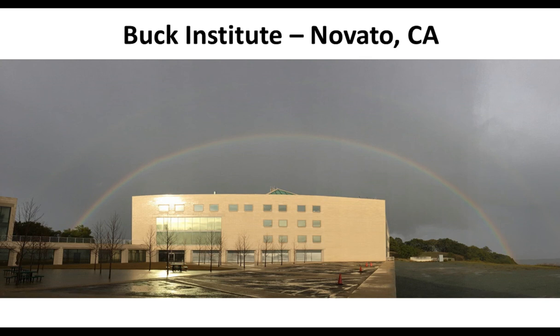You cannot exclude that, but I think the dynamic range enrichment that one does get through the affinity enrichment is a specific strength that really contributes to identifying that many sites.